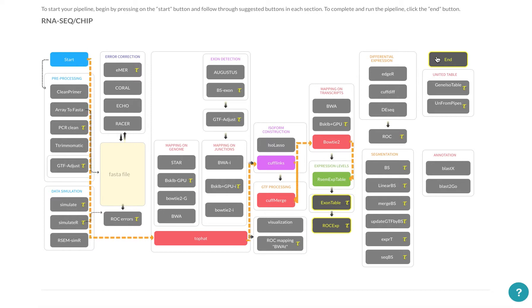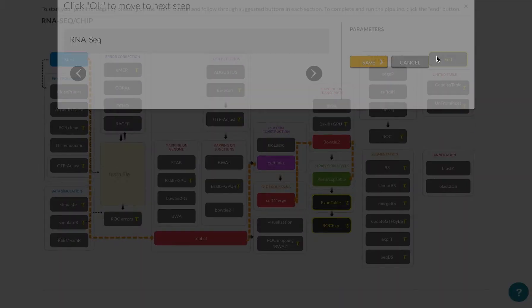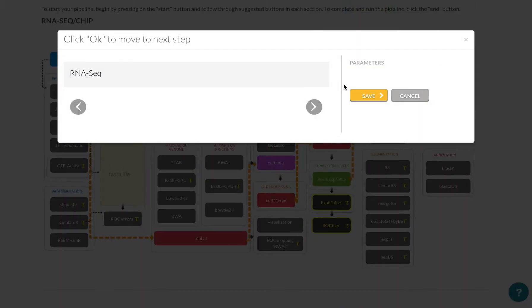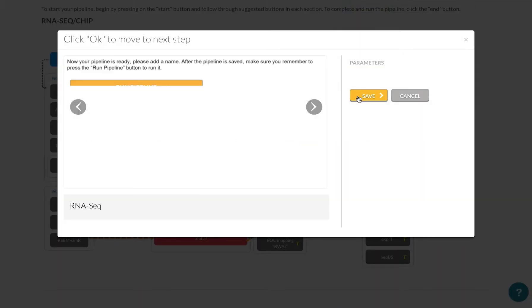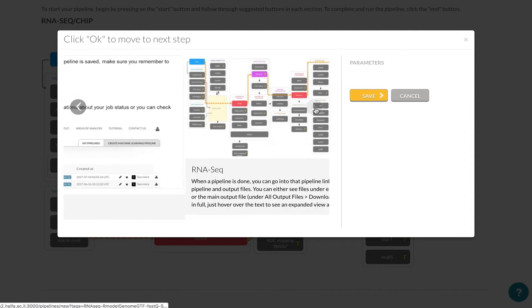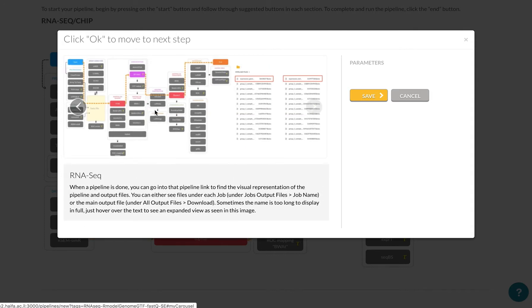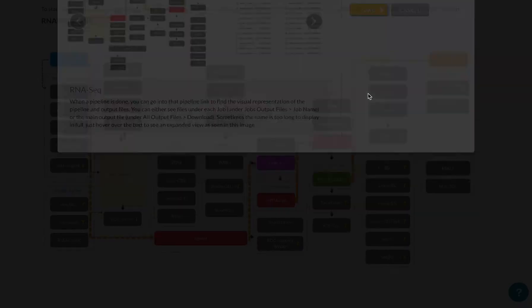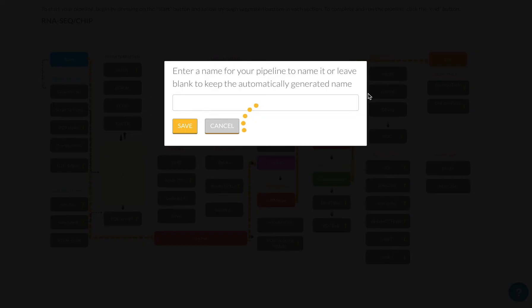And in the end, there's another area where you can read a little bit more. It reminds you to press on the run pipeline button after you're done. It also explains what kind of output files you're expected to get in the end. So I'm going to save this pipeline, I'm going to name it, save it.